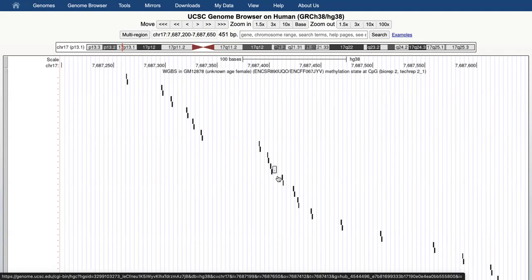While this does provide clear visual evidence, some limitations do exist. For example, certain promoter regions do have limited whole genome shotgun bisulfite sequencing coverage, and not all regulatory data are available for every cell line. So that might make it a little difficult to put things into perspective. But despite these challenges, UCSC does prove to be a valuable and accessible tool for exploring epigenetic regulation of genes, especially those with roles in cancer biology, like tumor suppressor genes like TP53.